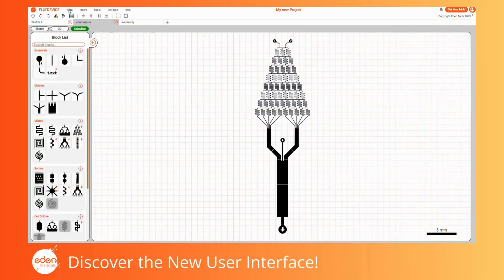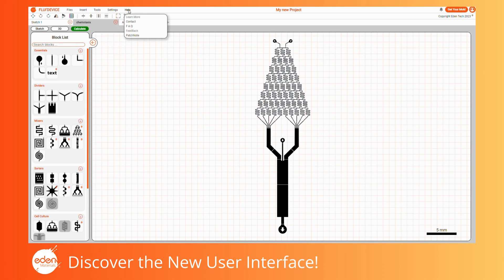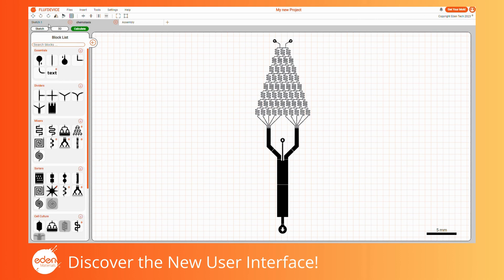Let's quickly go through the different elements on your screen. At the top, you'll find a comprehensive menu of all FluiDevice functionalities, sorted by categories. For instance, the help section includes a link to this tutorial video for future reference. Below is a toolbar with shortcuts to help you design faster, which we will cover in detail later. On the right, you'll see a descriptor of the actions you perform while using the software.